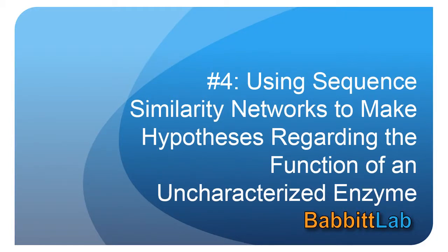This tutorial will show you how to use the Cytoscape software to make some hypotheses regarding the function of an uncharacterized enzyme by viewing it within the context of a large group of related enzymes. We'll be using a sequence similarity network for the terpene cyclase-like 2 subgroup of the isoprenoid synthase type 1 superfamily, downloaded from the Structure Function Linkage Database, or SFLD.